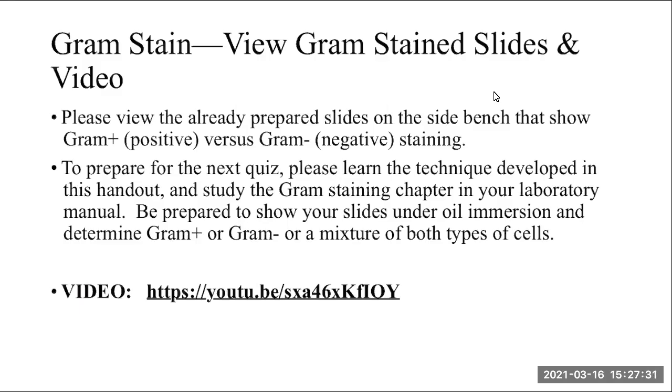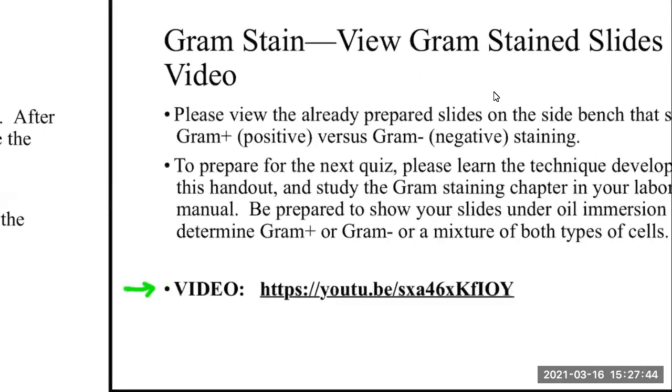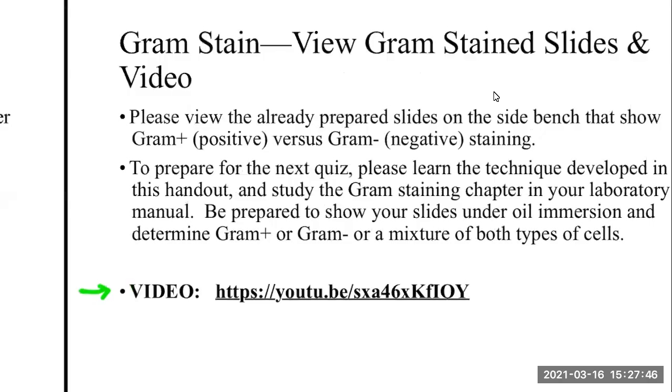If you do want more information on this technique, please view the video that there's the link for. But otherwise, you should be pretty well prepared to know how to do a Gram stain. Any questions?